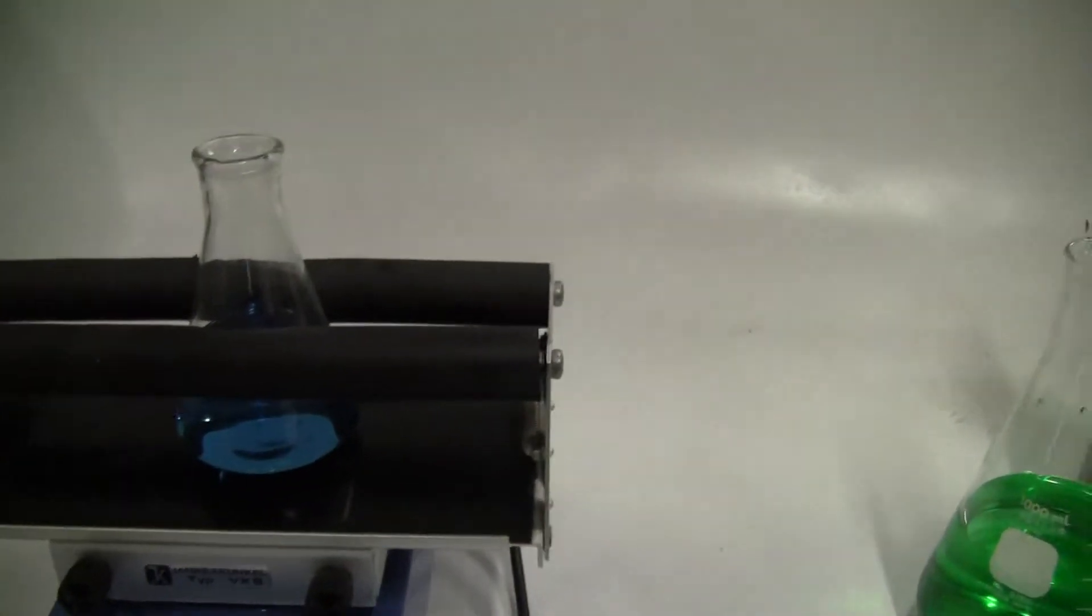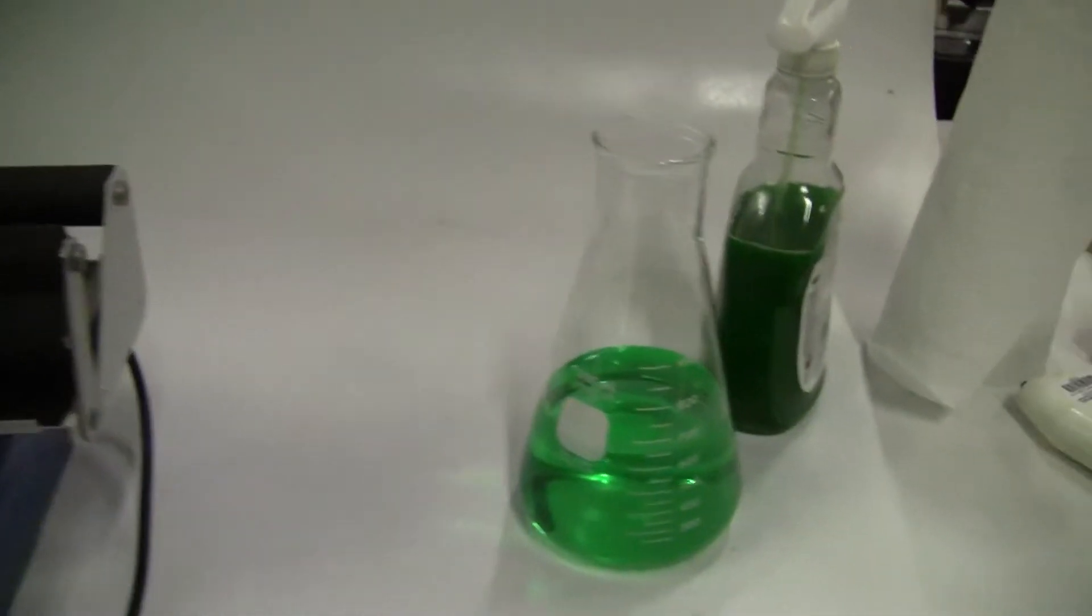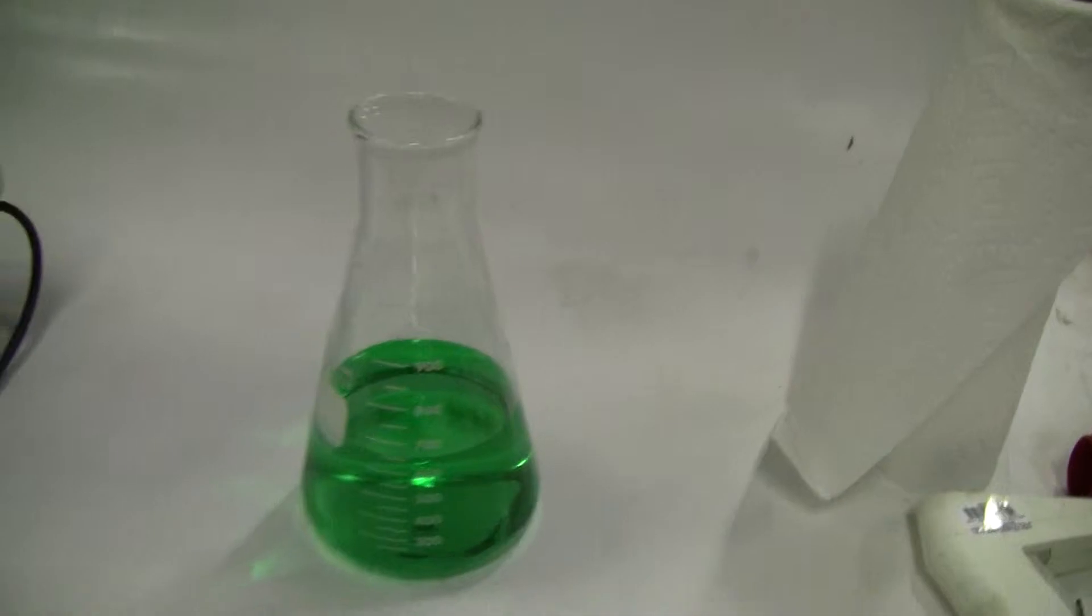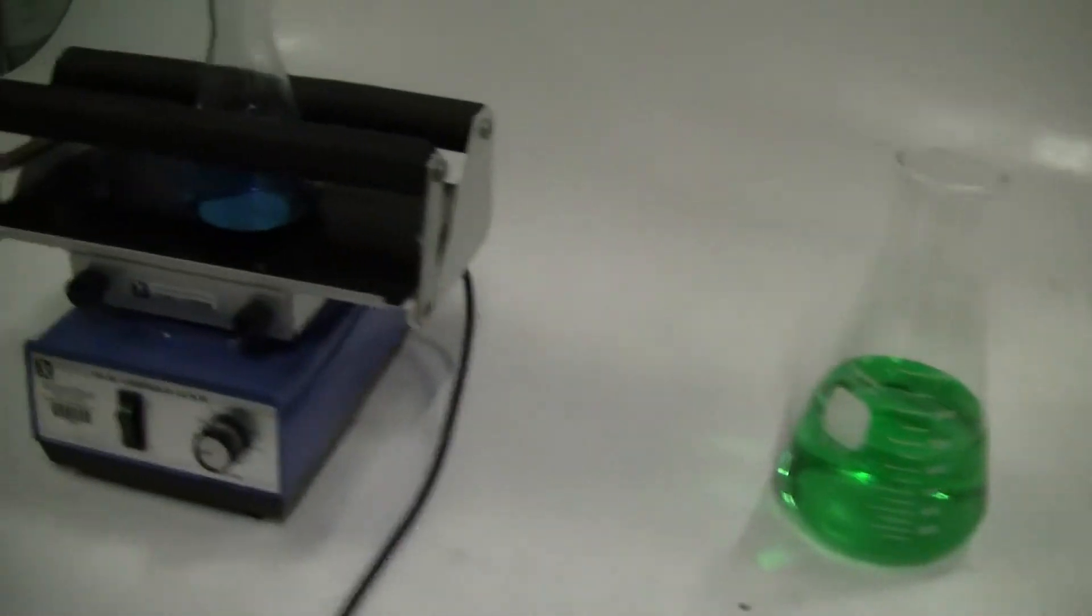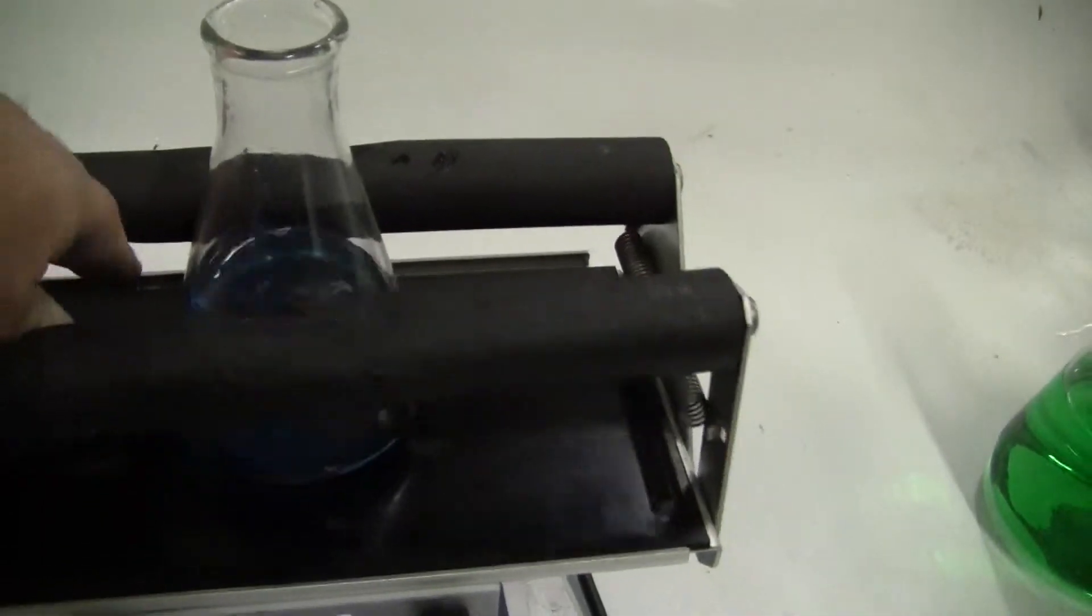We have it listed as holding a max of two 500 milliliter Erlenmeyer flasks, but as I'll show you in a minute, we have been able to run it with a 1 liter flask in there. It's got a universal holder, spring-loaded, so it's easy in and easy out.